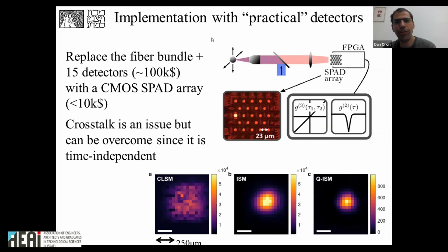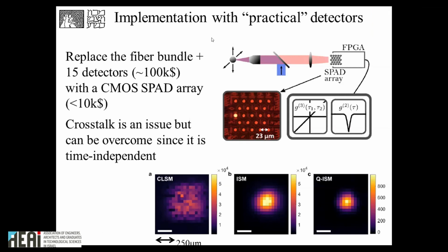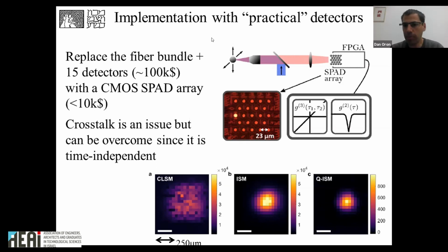Okay. How do you define the shot noise limit in the context of anti-bunching microscopy? So classical light would emit light in pairs. If you look at a laser, for example, this is classical light, and you may use a Hanbury Brown and Twiss setup. Sometimes both detectors would click. That's because in the Fock basis, the basis of the number of photons per unit time, you have a Poisson distribution, which means sometimes 0, sometimes 1, sometimes 2, etc.